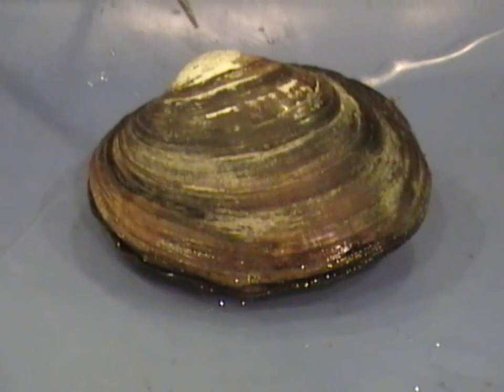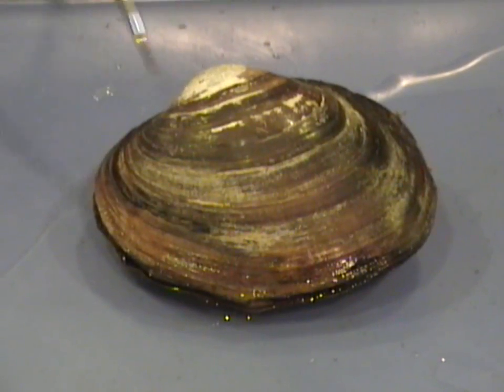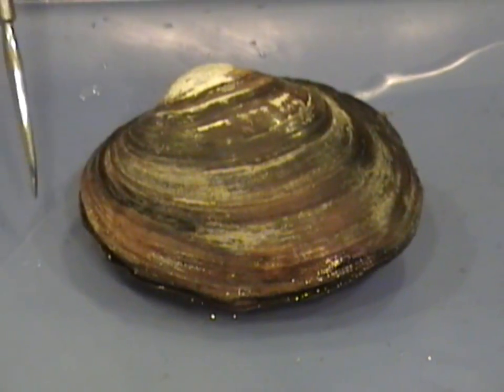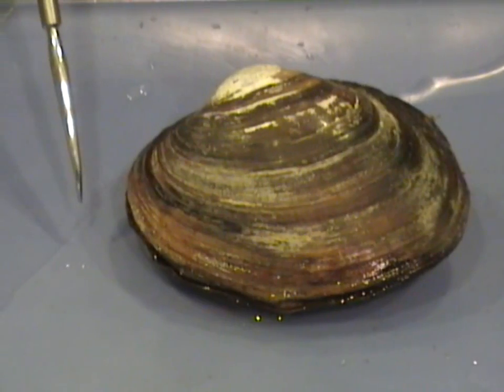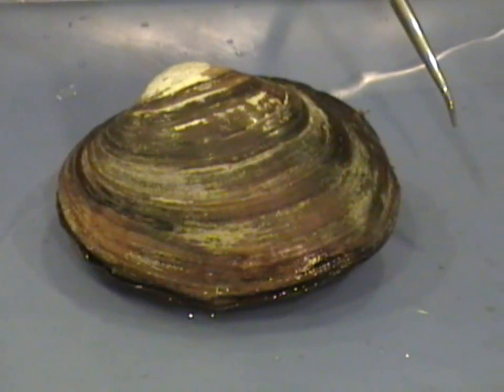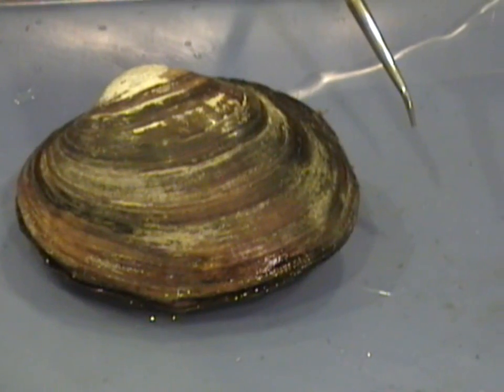Now looking back to the umbo, since it's closer to this end rather than to this end, this end is the anterior portion of the shell. And this end is the posterior portion of the bivalve.